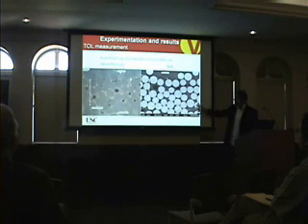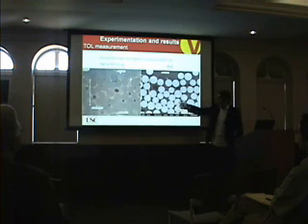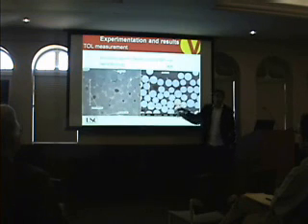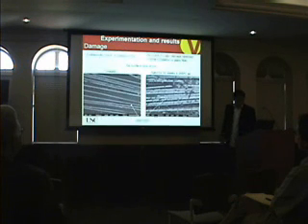But with this picture, not only can we measure the oxidation thickness, but we can also see the morphology of our epoxy. As you see, we have many voids, and we can measure the void distribution, which we are right now measuring.